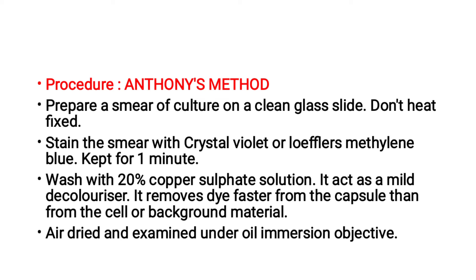After one minute, wash the smear with 20% copper sulphate solution. The copper sulphate acts as a mild decolorizer — it removes dye faster from the capsule than from the cell or background material. After adding the 20% copper sulphate solution, air dry and examine under the oil immersion objective.